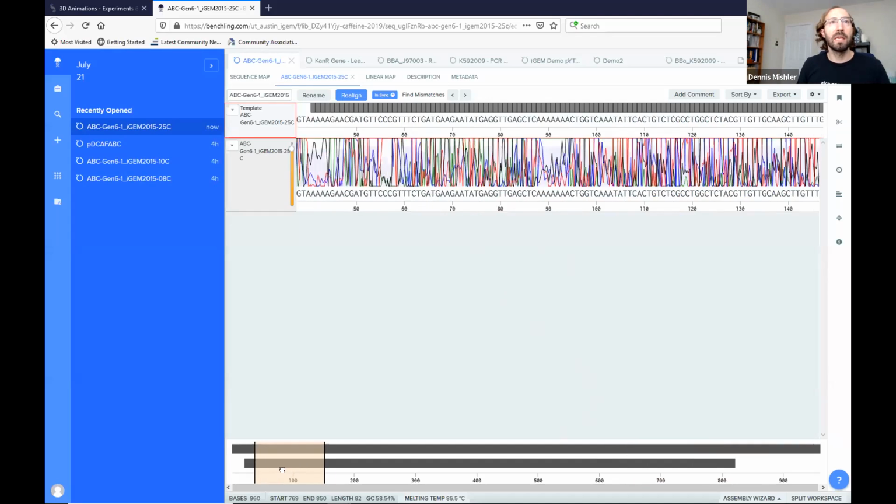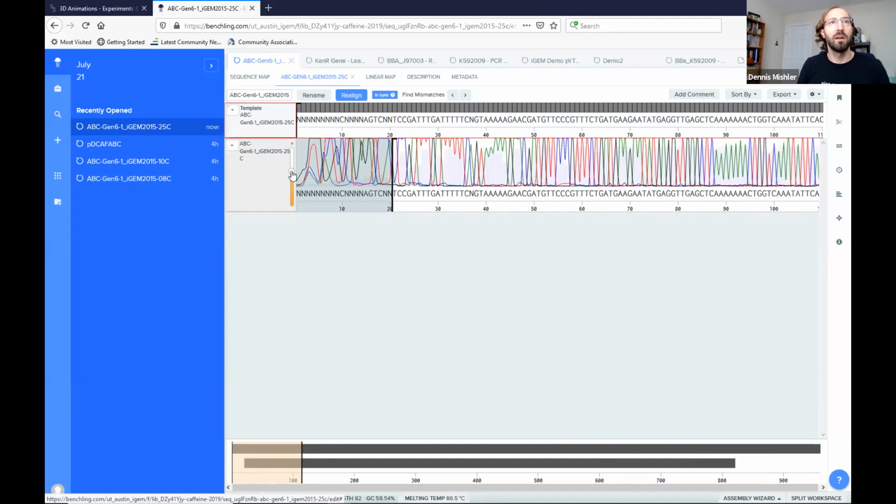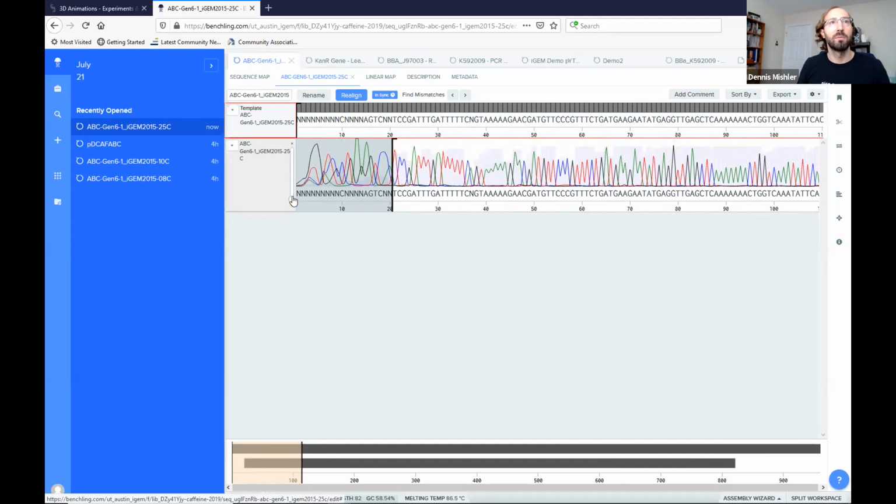And we can go back to the beginning, and you can see how high the peaks are here. So we're going to change this amplitude modulator, bring it back down, boom. And here you can see the first 10 or 20 nucleotides are also Ns. When you're doing your sequencing reaction, what's really common is that at the very beginning, the first 20, 30 nucleotides, the system is just trying to get everything under control. And so you often can't look at that data either. You really want to start a little bit later.